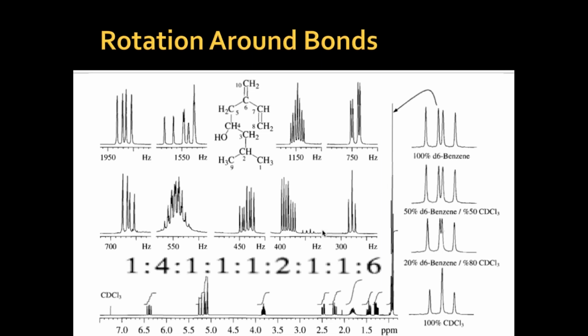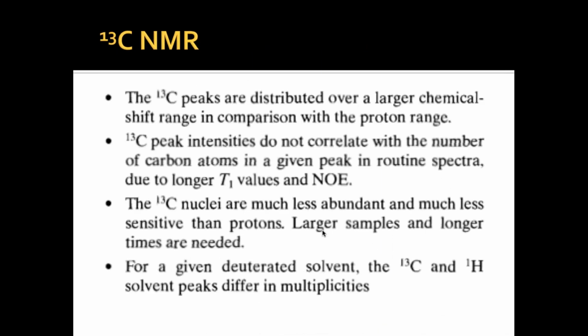As we go to the more complicated structures, we need the help of detailed NMRs. We use C13 NMR. C13 NMR is different from proton NMR.